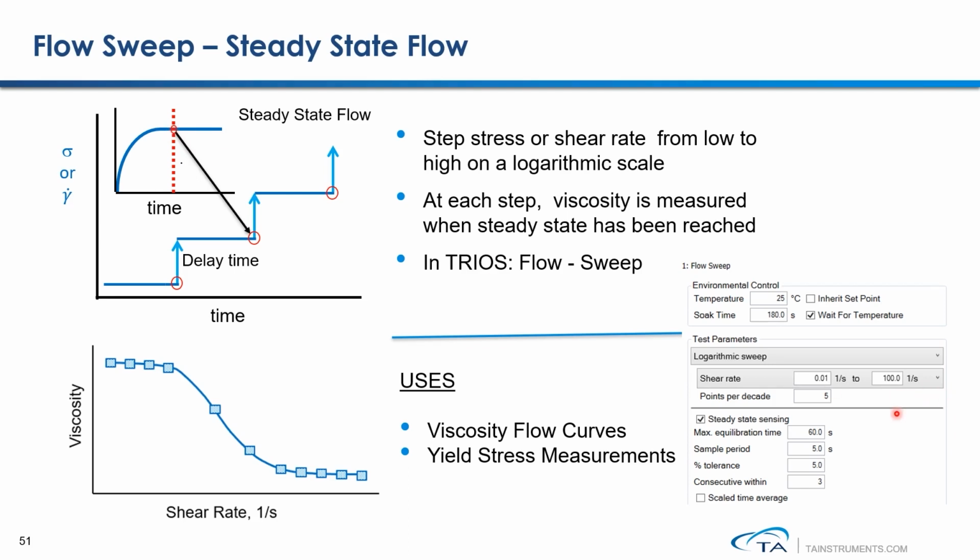After you finish your measurements, there is a parameter called reason for termination. If it says equilibrium, that means this data is collected under equilibration. But if that parameter shows time expired, that means that data is questionable, because you maxed out the time and still did not reach equilibration. Of course, all of these numbers, the time for each data point being collected and the maximum equilibration time, can all be adjusted based on the operator's need.